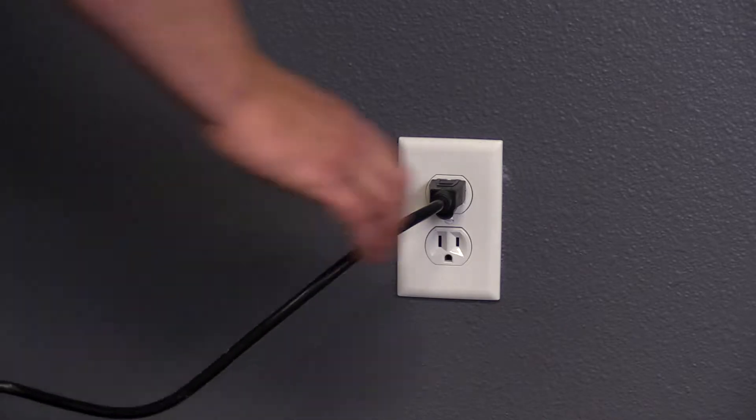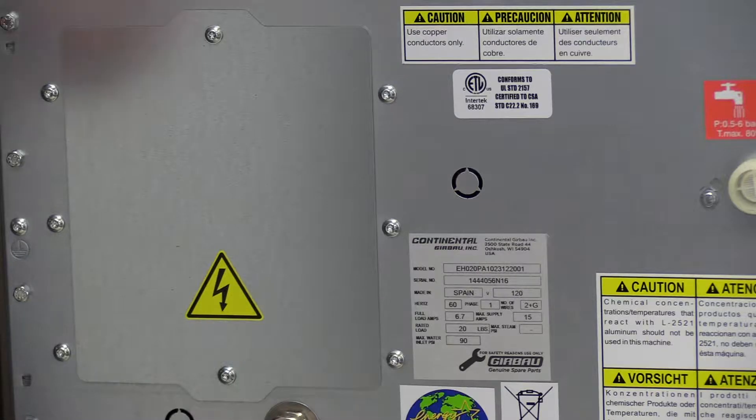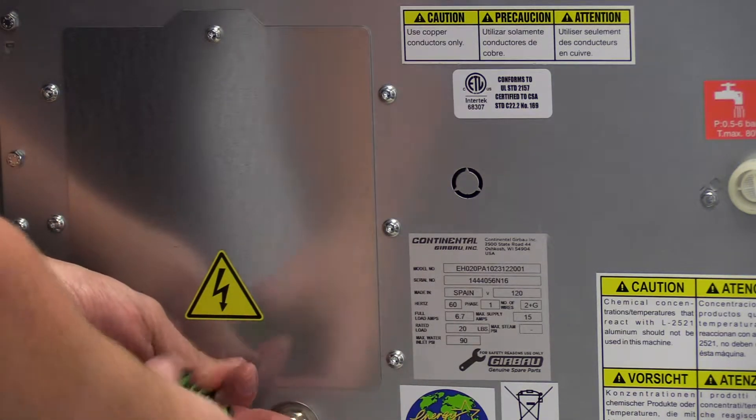First, disconnect power to the washer. You might want to wait three to five minutes for power to dissipate. Locate the terminal connection on the back of the washer.